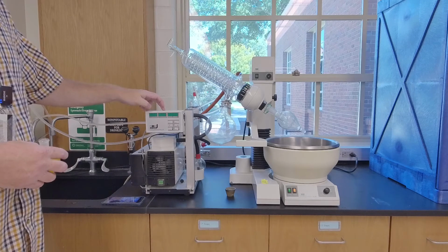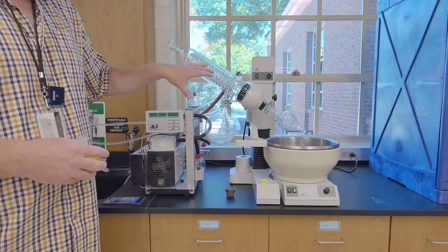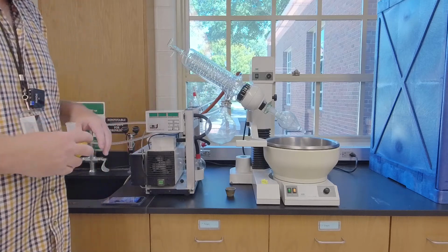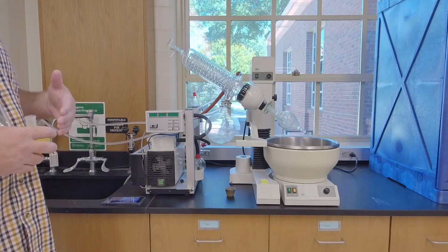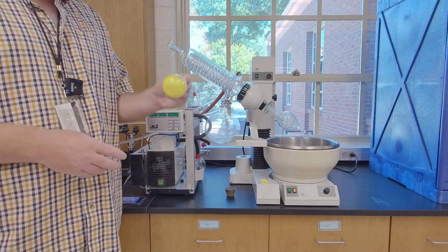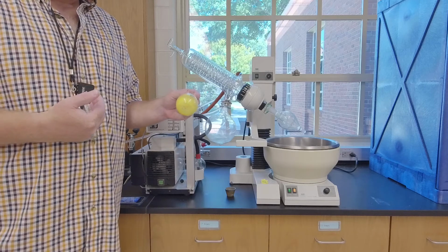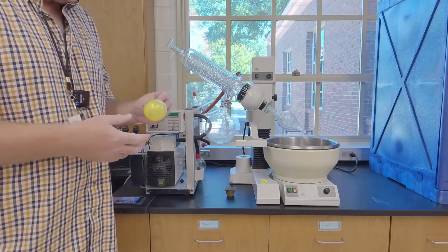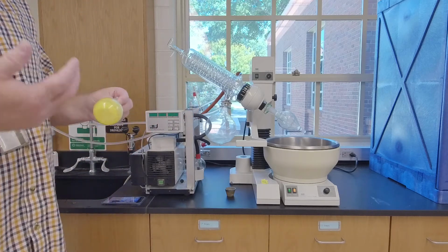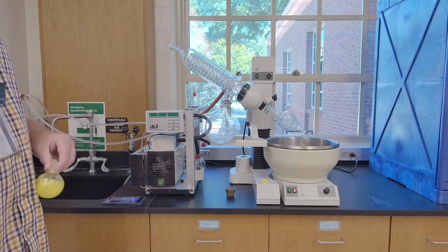So we have this vacuum source that's going to evacuate this entire area that's got your solution in it, and that's going to effectively lower the boiling point of the solvent, right? And so this never got above 30 degrees C, and yet we evaporated a solvent that boils at 70 degrees C. Pretty slick, huh? So if this yellow material were something that were heat sensitive, like maybe it decomposes at 50 degrees, it's still fine.